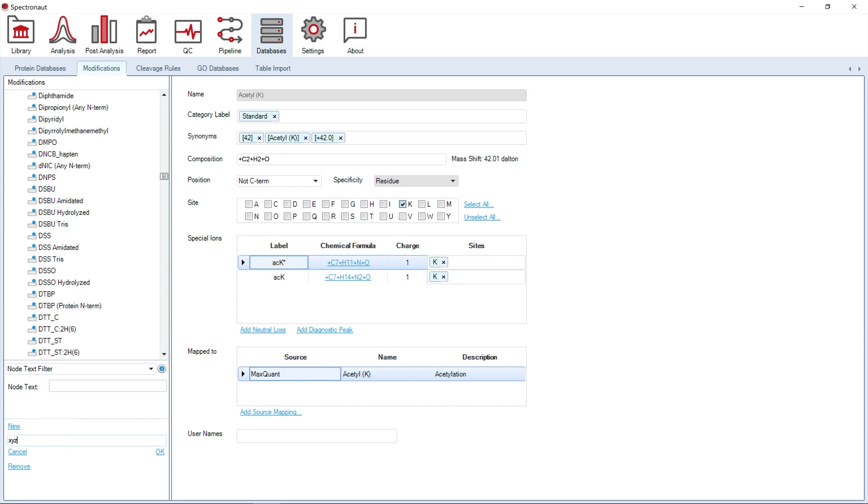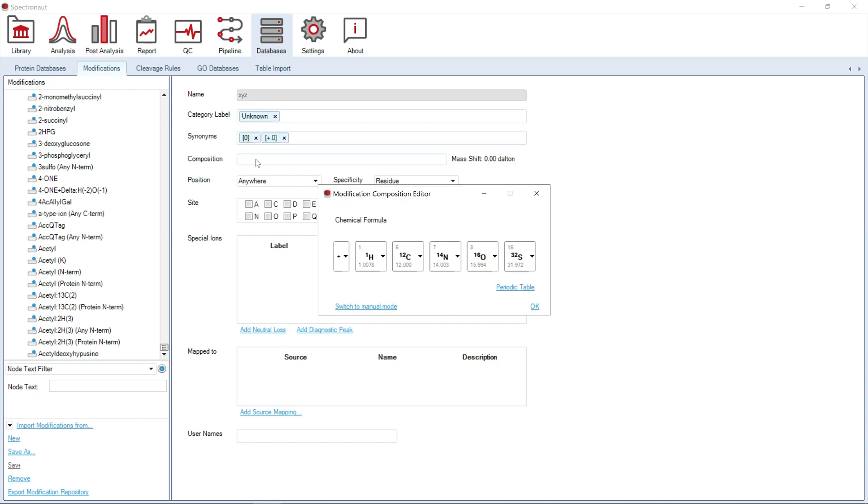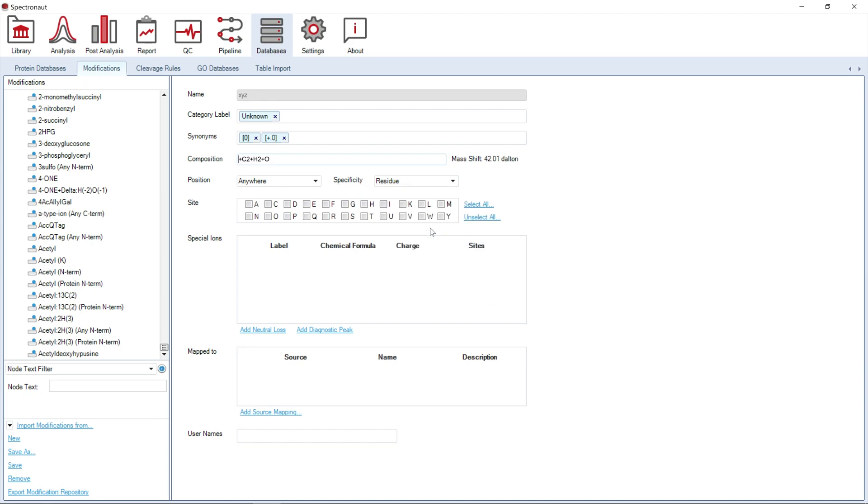To do that, simply select the new modification option, give it a name, and specify the chemical formula of the modification and amino acid residues that this modification applies to.